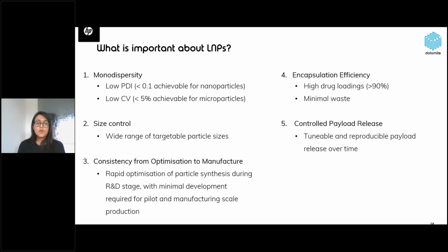And as well as all of those things, we want to have encapsulation efficiency as high as possible, and obviously a controlled payload release. So downstream in your applications, when you're actually using that in vivo, for example, or doing some clinical trials, you want to be able to have that control in terms of payload release as well.